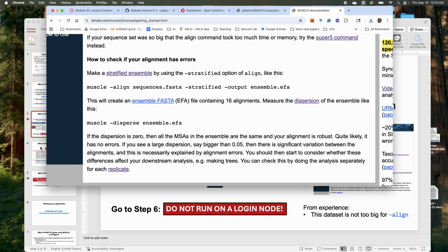So first, in the interact. Go to... oh, no, because it's in your interact. That's different. You don't have to put that in. You're almost there. Okay. Step 6 will tell you how to start the interact session.